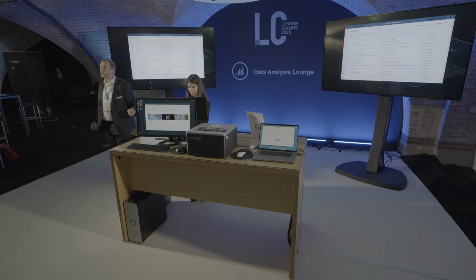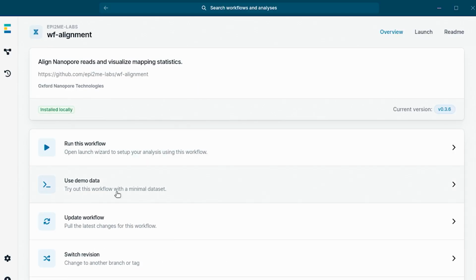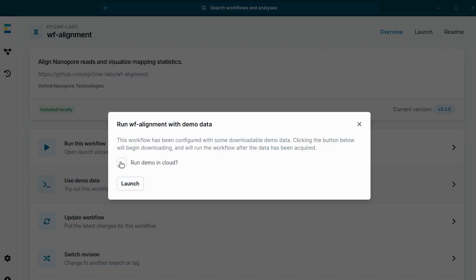Our new product, which we're going to be talking about increasingly, we've got a register your interest QR code over there, enables the same familiar analyses that you've been using on device, on your laptop, on your gridiron, but you can run the data analysis in the cloud. This means that you can be a little bit more ambitious in the way that you run your studies. You do not have to run data sets that are restricted or appropriate for your own compute resource.